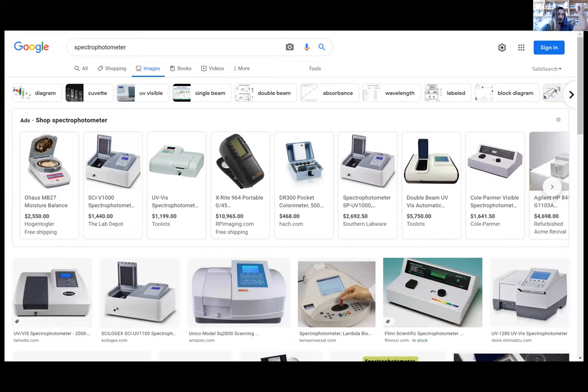You can't just look. I mean, after like maybe 20 years of biology, you can guesstimate. Like, I'm okay with optical density. I'm normally off by like 0.05 when it comes to it. So like I can eyeball it, but I also know my strains really well. I know at exactly 4 hours, NEB Turbos in my lab will be at 0.5. So that's handy. But if you're just starting out and you need this device, you're going to pay, you know, $1,000 for something to read a single wavelength of light.